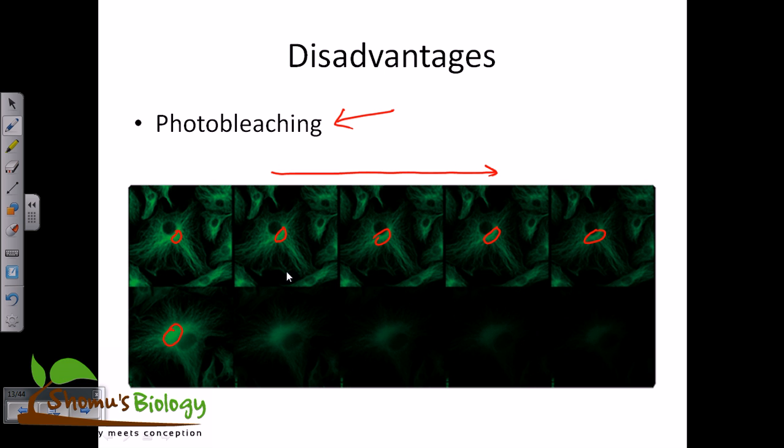So to remove this particular problem, we need to create a modified version of fluorescence microscopy called confocal microscopy, which eliminates all the scattered emission light coming from different planes of the sample, and only selects the particular point which is the point of focus, and only allows the light to come from that particular plane, not any other plane, which will give us much better understanding. But obviously there are some drawbacks, so we'll be talking about confocal microscopy in the next discussion.